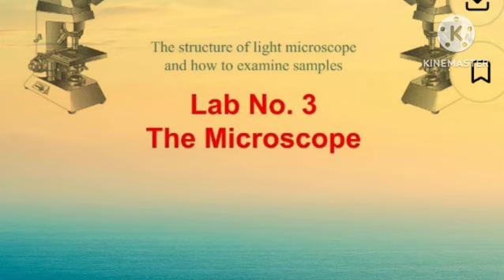The compound light microscope uses a multi-lens system and visible light to magnify bacteria, fungi, and protozoa. It is vital for observing cell morphology, arrangement, and staining characteristics. Microscopic terms: organisms too small for the naked eye can be visualized, such as bacteria.